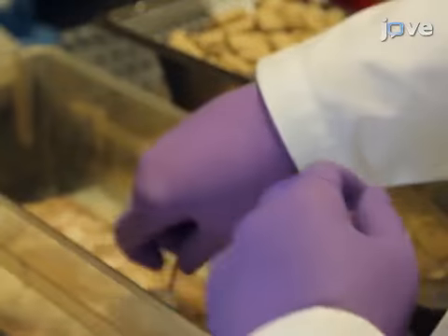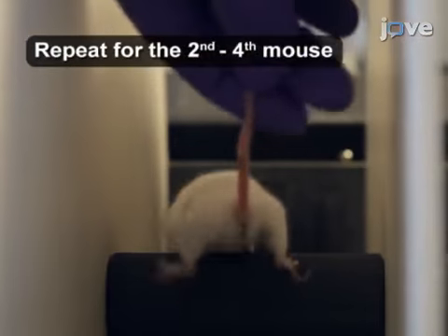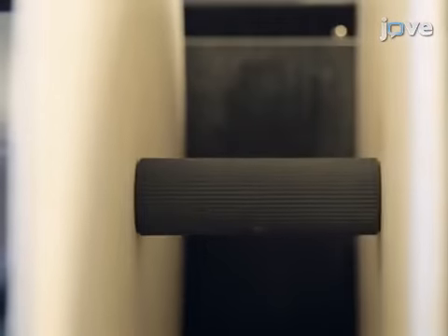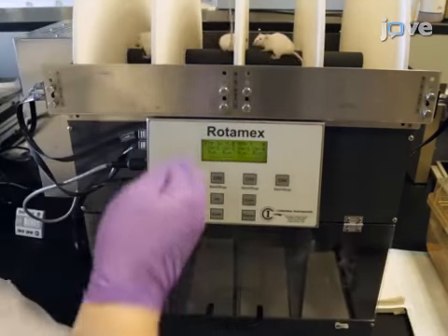Then, pick up a mouse by the tail and place it on the rod facing away from the operator. If the mouse falls or jumps, place it back in its lane on the Rotarod until all mice are in position.